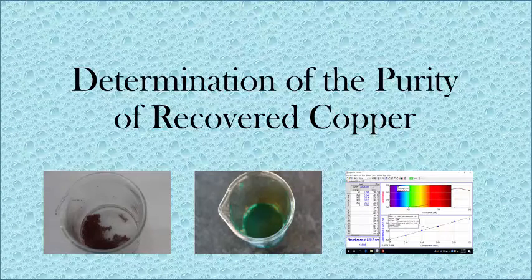Last week, you performed a series of experiments on copper. At the end of the lab, you should have ended with copper. In today's experiment, you will determine how pure the copper is, or if there are impurities in the sample.